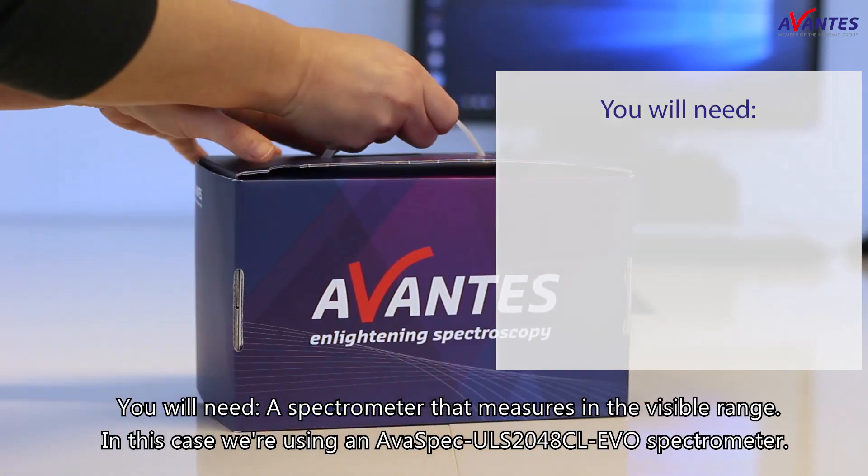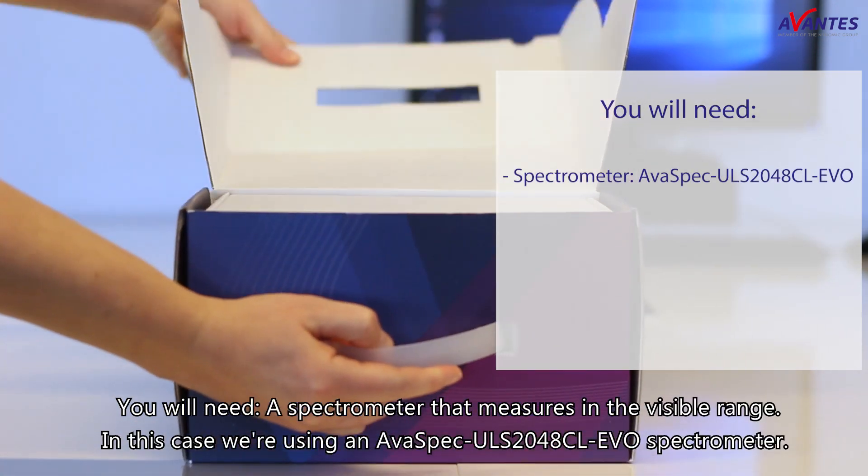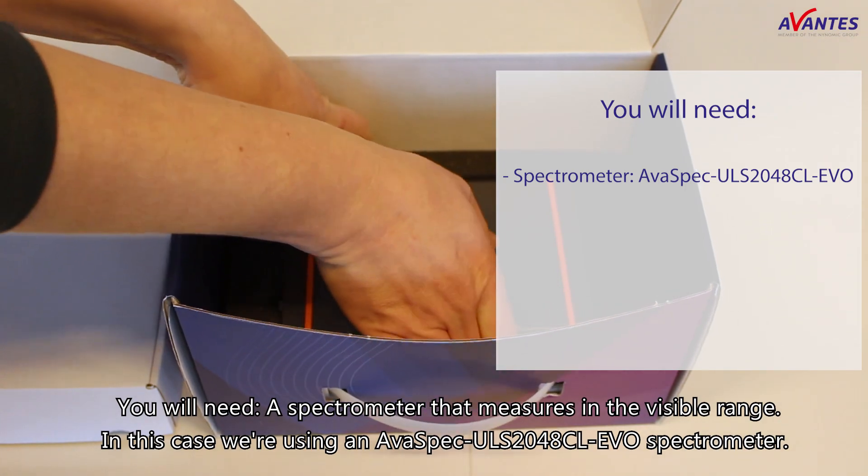You will need a spectrometer that measures in the visible range. In this case, we're using an AlfaSPEC ULS 2048 CL Eco-Spectrometer.